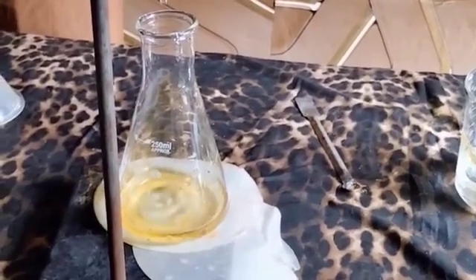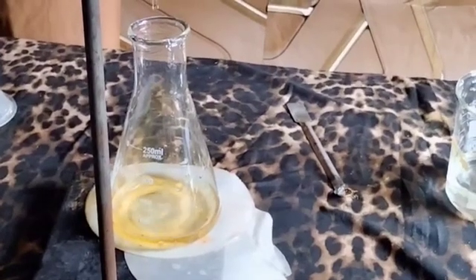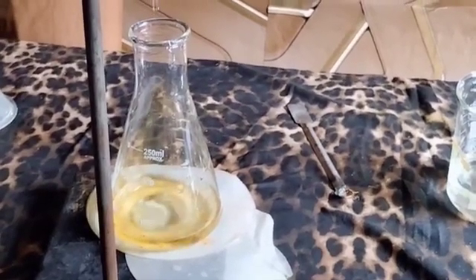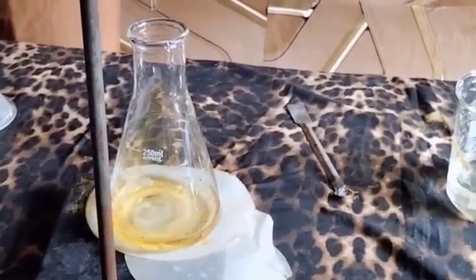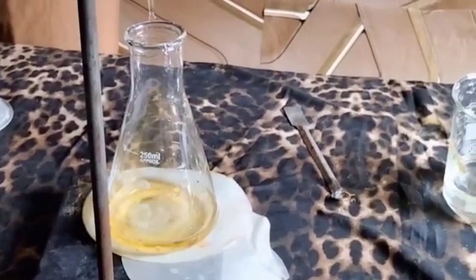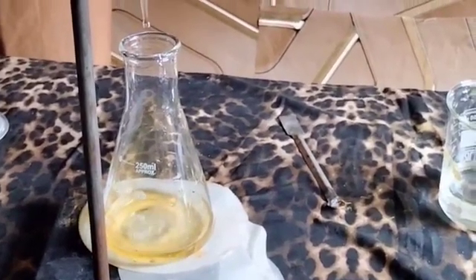So, as we're moving on, gradually we're approaching 8. We're moving on to see when the color will change. So take it slowly and see. We're going to have the accurate end point.